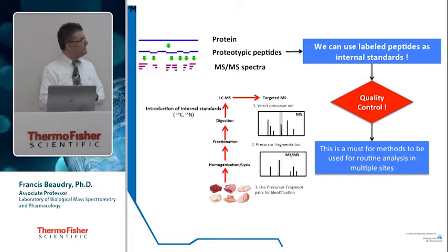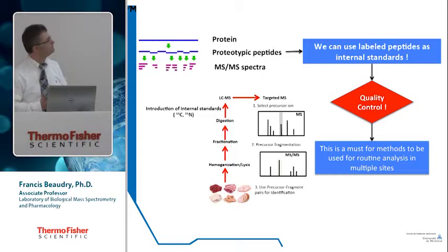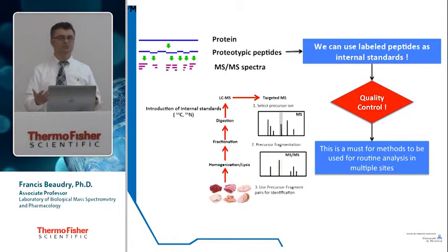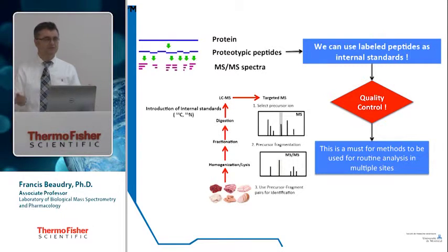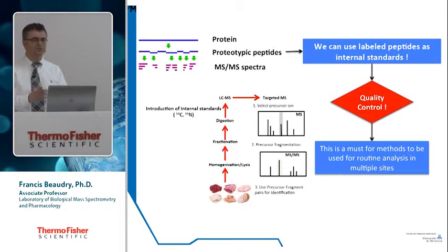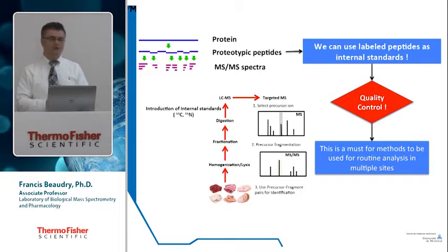There is another very interesting advantage of this. When we know exactly which peptide we are targeting, we can do real quality control. How we can do real quality control is we can synthesize cold peptide, so it's the real peptide, and we can synthesize heavy labeled peptides. So we can label the peptide with C13, nitrogen 15, even deuterium. I'm using deuterium quite often. It works well with small molecules. Sometimes it doesn't work that well, but for peptides it does work well. So deuterium is a cost-effective way of doing it as well. So if you're cost limited, that's something you could do.